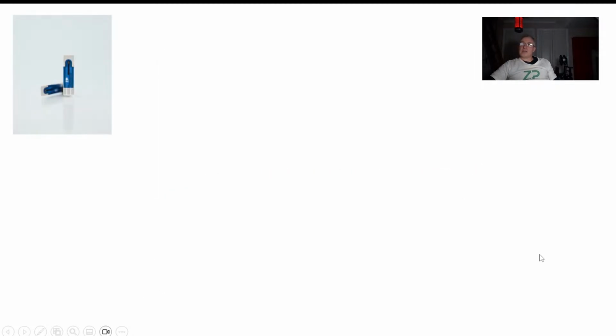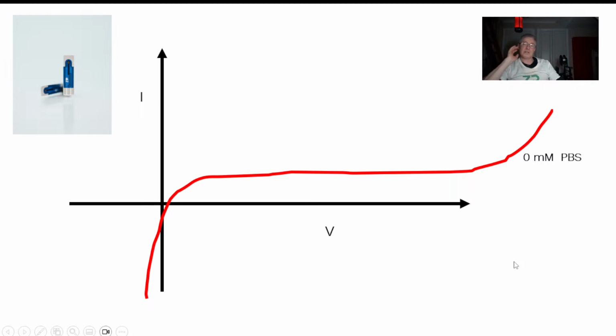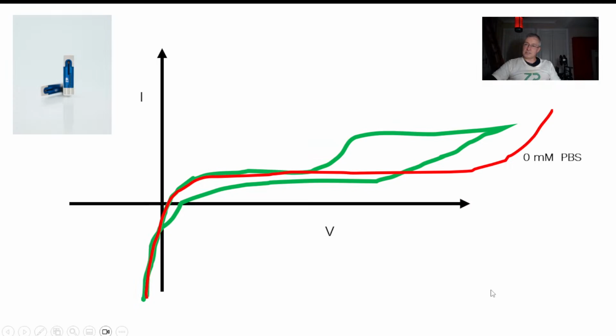If you're going to make a biosensor, and let's say you're going to make an oxidase-based biosensor, get hold of a ZP platinum sensor, and the first experiment I would do is just sense what that baseline signal will do. Then, to teach yourself, do a cyclic voltammogram on a solution like 0.1 millimolar hydrogen peroxide, again in PBS, and just look at that difference. Just get a sense of, okay, so that's what the blank platinum sensor looks like. Now I test with a bit of hydrogen peroxide. Okay, now I see the difference.